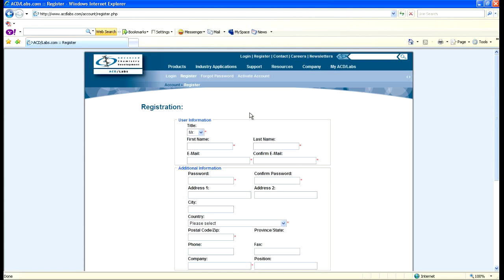Once you download it, you can go ahead and install it as you would any other software package, and then launch the program.